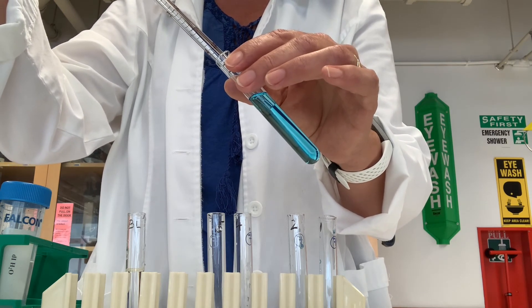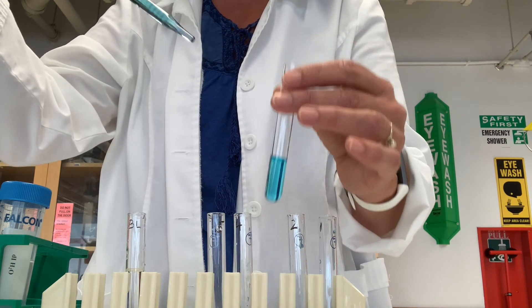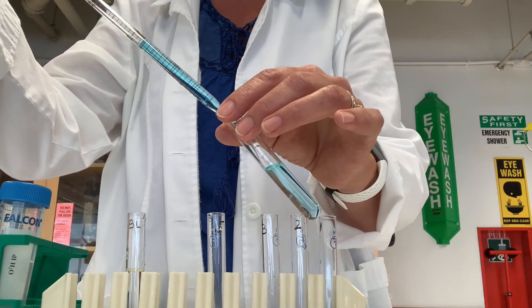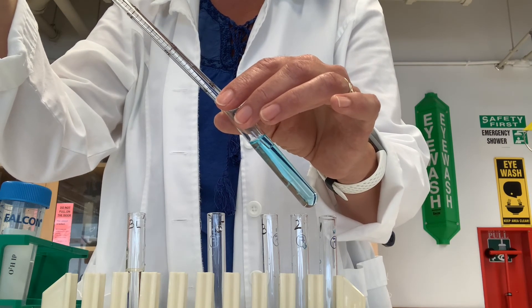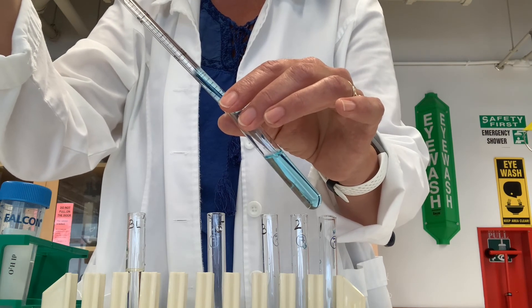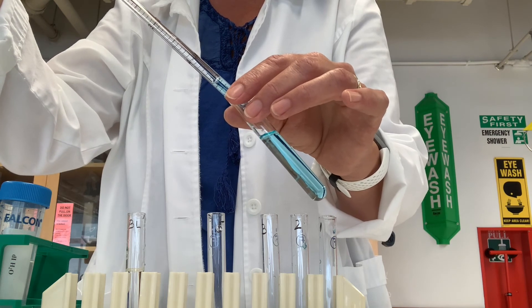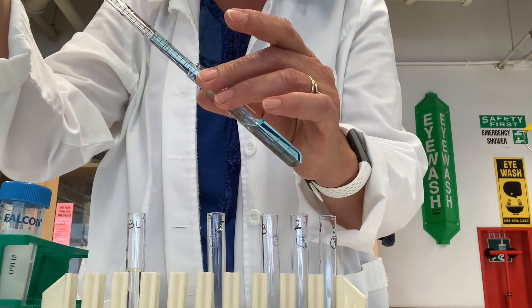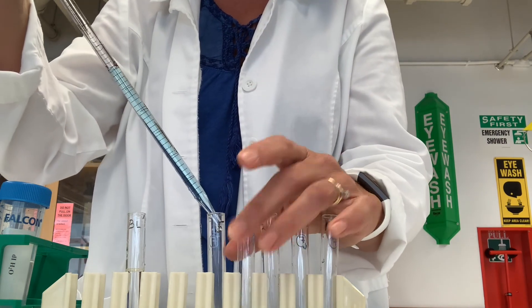Now we're going to do the next serial dilution. I draw out three milliliters and transfer to tube four, then pipette up and down to mix. I then draw the last three milliliters after mixing and transfer those three milliliters to tube five.